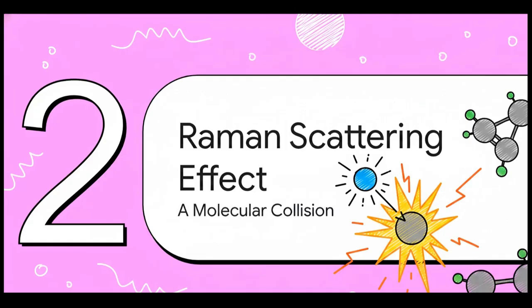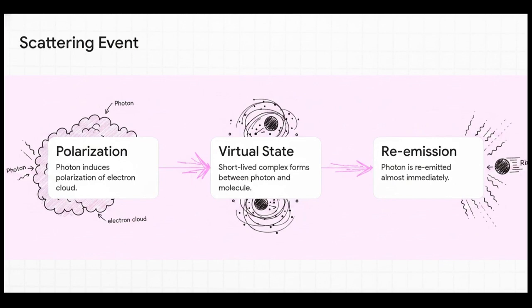Moving right along to Section 2. The Raman scattering effect, a molecular collision. Now, let's zoom in on that specific scattering event and look at what happens during an energetic collision between a single photon of light and a target molecule. Think of this as a dynamic, high-speed car crash, but at the molecular level.